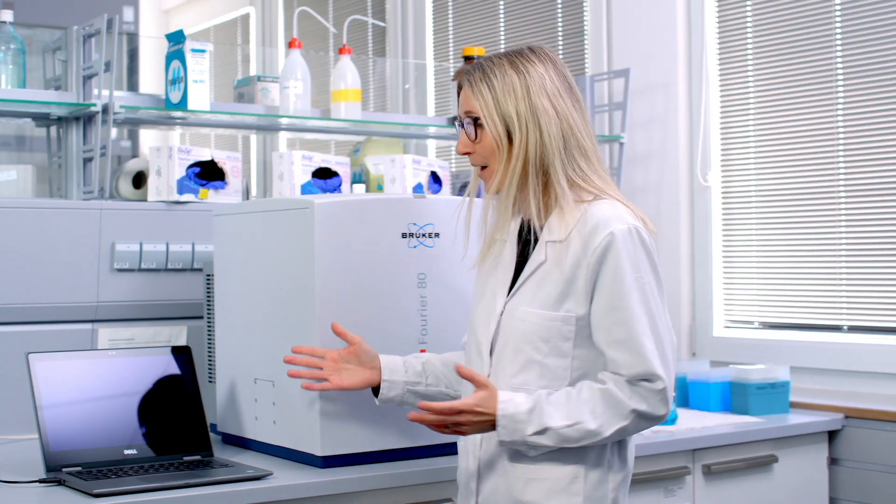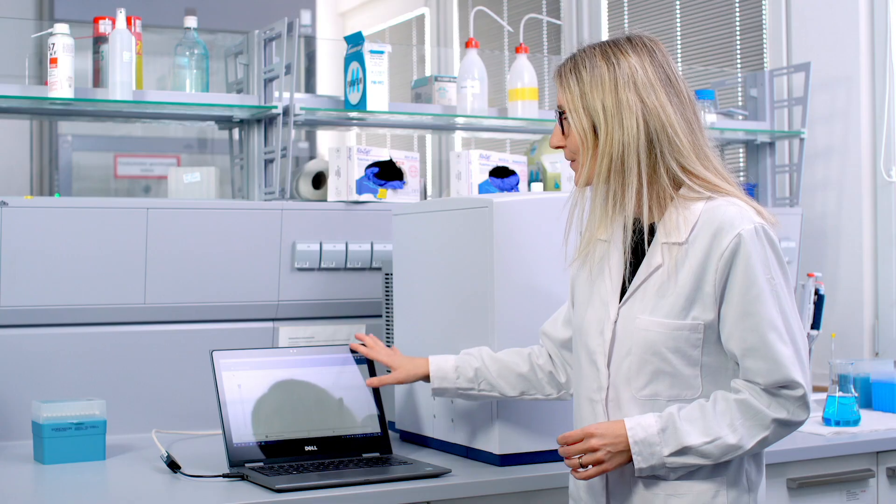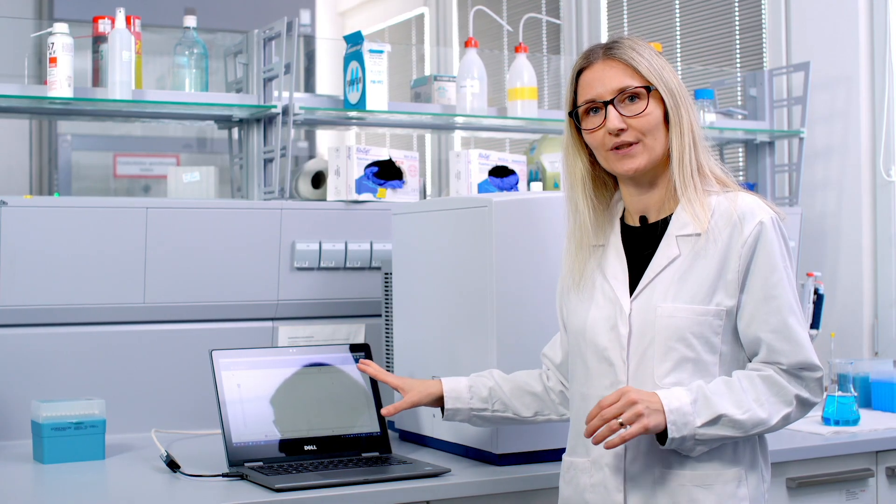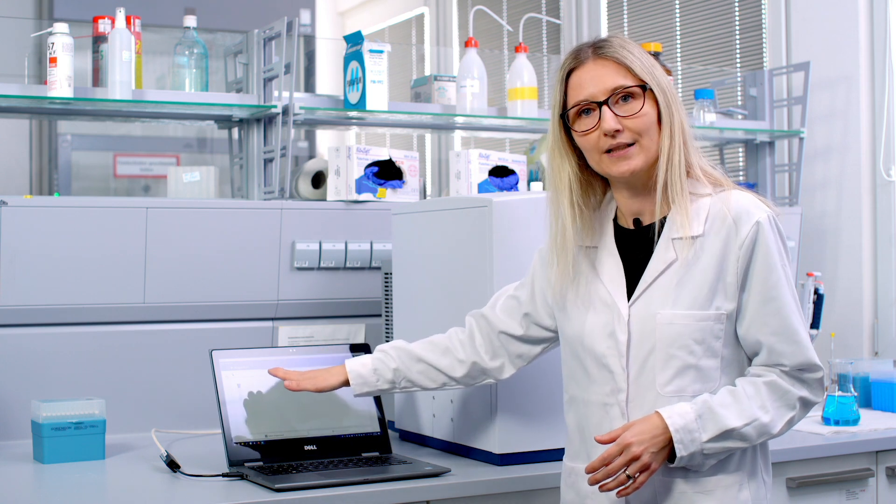Everything else actually happens on the computer. So with our Fourier 80 there comes a nice user interface which is straightforward and it's called GoScan and is really intuitive and meant for the not so much experienced NMR users. So you just need to enter your sample ID.